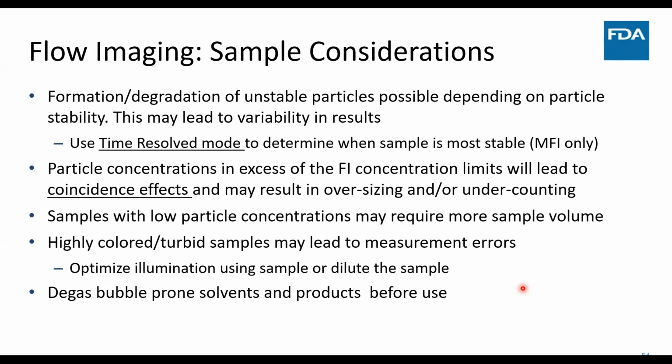Degradation of particles can occur over time. So having a time resolve mode, especially with MFI, allows us to do a quick check of the stability of your particles over time, making sure your particles are not degrading as they are being pumped through the system. Particle concentration in excess of your maximum limit will lead to coincidence effects.